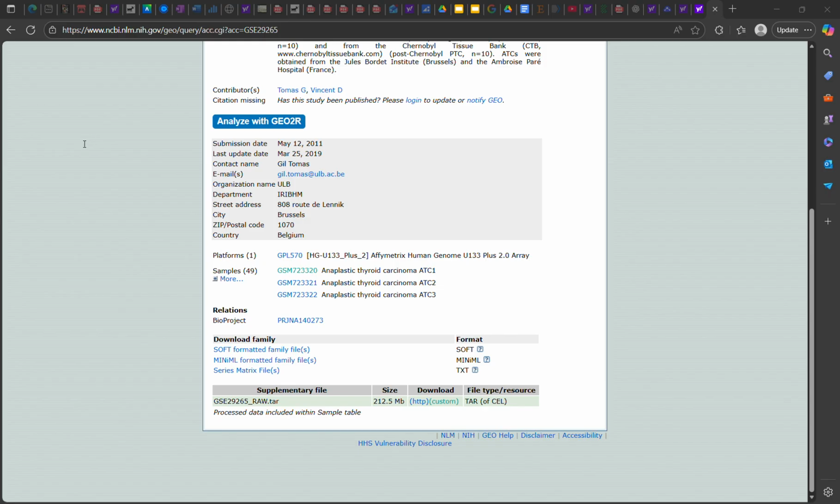Now, we already put this into the data frame here, but now we have to get the subset, specifically the subset of the probe ID and the gene symbols, and put that into a new feature data. It's called the same as the first feature data, which is a little confusing, I realize now, but this is just feature data 2 and this is feature data 1.